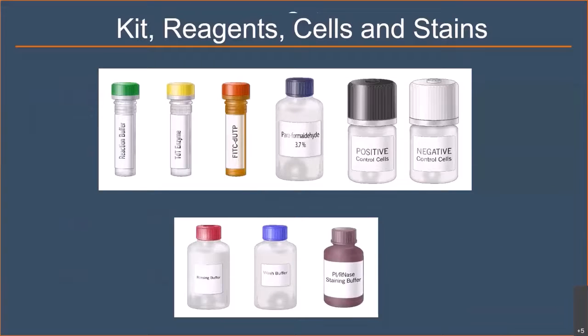This figure illustrates the kits, the reagents that are used, as well as the positive and the negative controls that come with the kit used for measuring the DNA fragmentation.